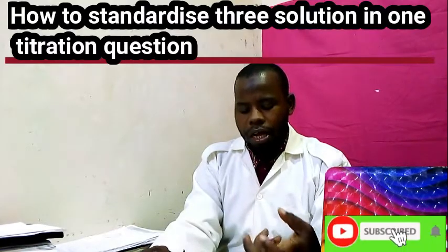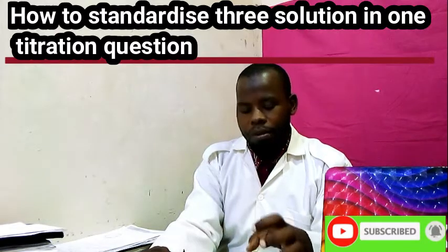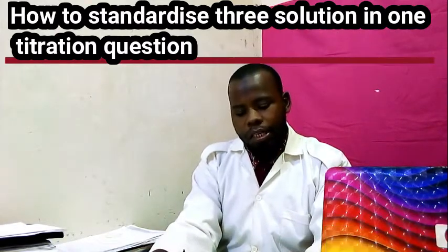In addition, when you titrate with the potassium permanganate and the sodium oxalate, there is heat. You have to heat sodium oxalate. That's why there is a question asked: why do you heat sodium oxalate with the sulfuric acid? Sulfuric acid is to introduce an acidic medium, which you are going to put in with potassium permanganate, because a redox reaction cannot be performed without an acidic medium or must react under an acidic medium.